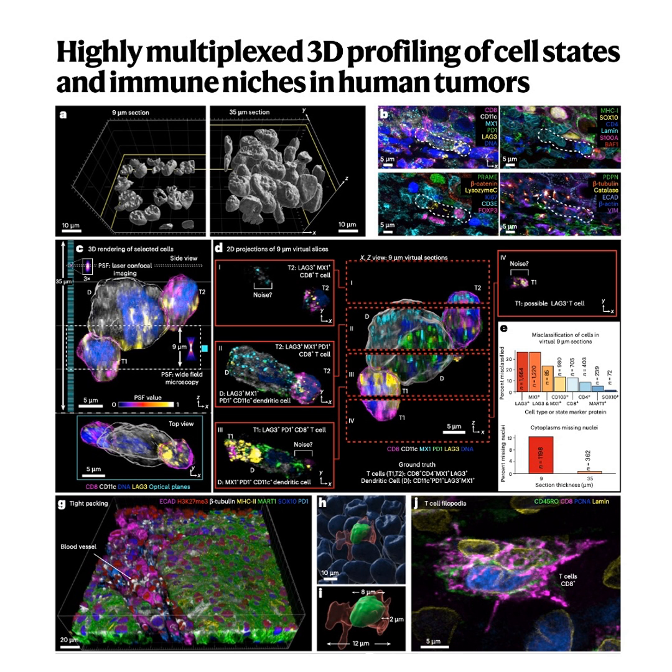In 3D, they can see PD-1 and PD-L1 molecules clustering together into distinct focal points, or puncta, specifically and only at the interface where a PD-1 positive T cell was physically touching a PD-L1 expressing cell, like a dendritic cell in their example. So they could actually see the molecular handshake forming. Exactly. They could even count these functional contacts. In one case, they found 13 distinct PD-1, PD-L1 foci concentrated over a tiny contact area of just 40 square micrometers between two cells. This confirms it's not just proximity, it's a functional signaling nexus being formed.